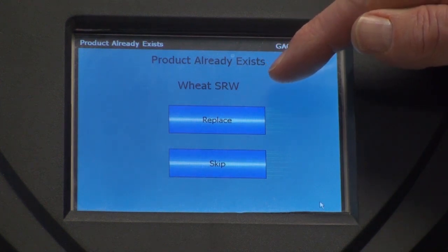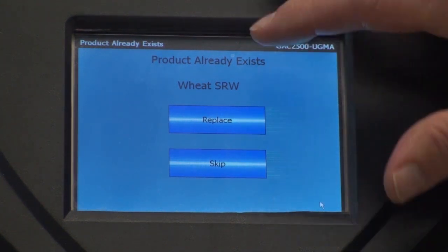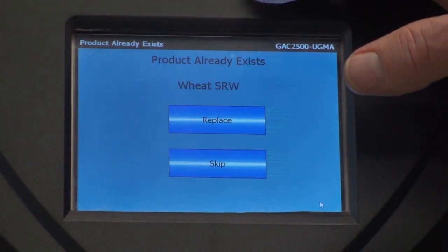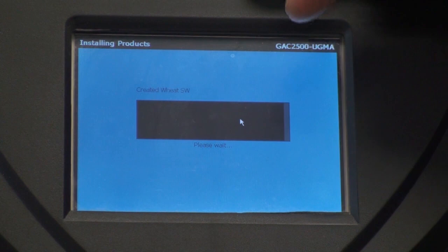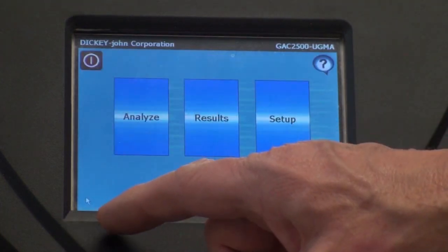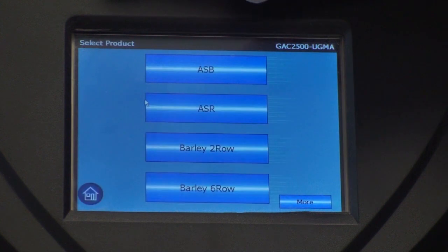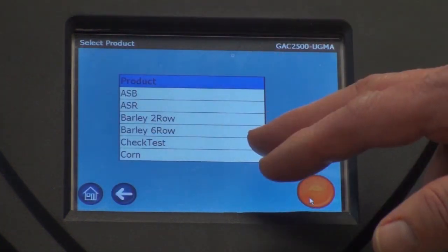There's the file we loaded previously — it will now ask you if you want to replace that file or if you want to skip it. At this point it doesn't matter because it is the same file. So that concludes the loading of the products. After we're all loaded, it will go back to the menu and you can now go to the home page.